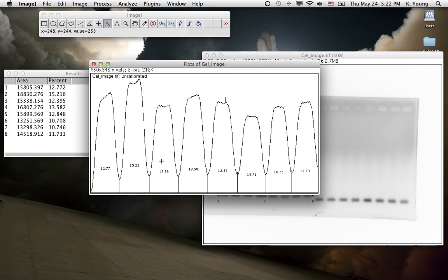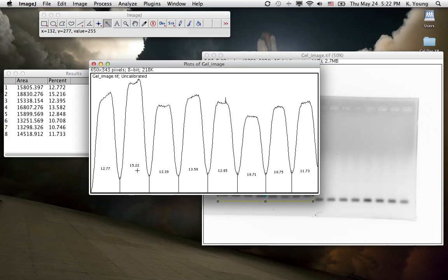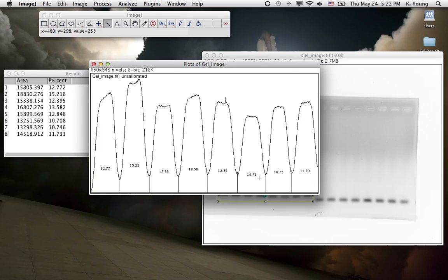So if you want to plug this into an Excel spreadsheet and look at the highest intensity band, which is 15.22, divide that by itself, and you get 100%, then take this value and divide it by that, you get a percentage of knockdown.